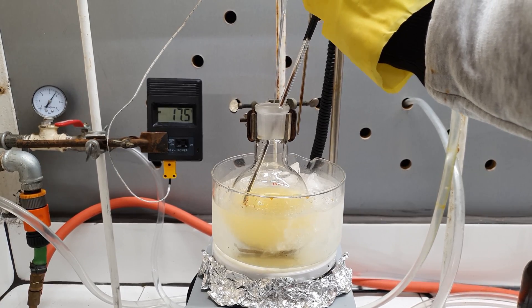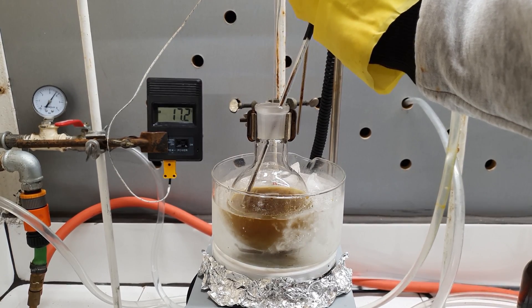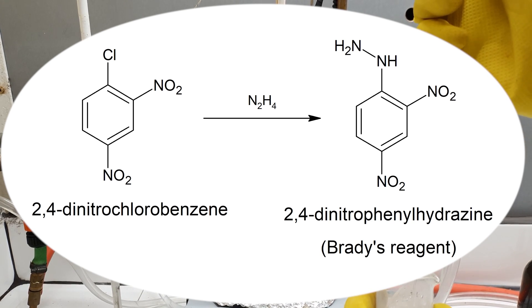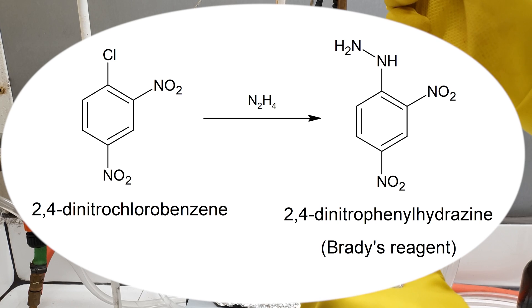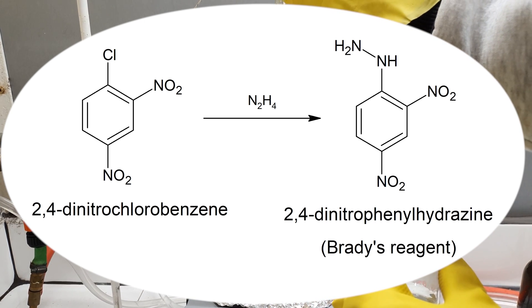As soon as it touched the surface, a dark color started to form. This is actually the Brady's reagent, which was even more evident later when it turned all red. The reaction wasn't exothermic at all, which honestly was very relieving. In terms of the reaction mechanism, the chlorine atom from the aromatic ring is being replaced with a hydrazine group. Normally, halogens bound to an aromatic ring are very difficult to substitute. However, in this case we have two nitro groups on the ring, which favors this reaction. In the end, we get our desired 2,4-dinitrophenylhydrazine.